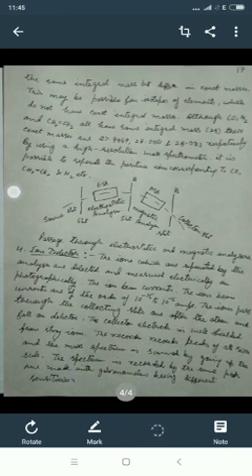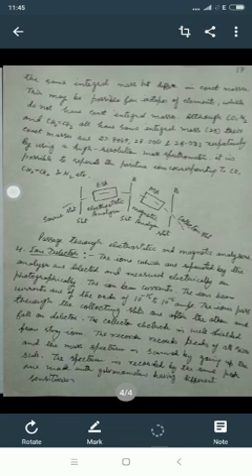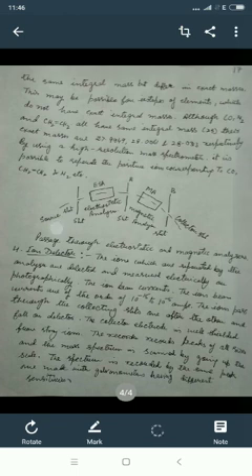The recorder records peaks of all sizes, and the mass spectrum is scanned by changing the scales, and the spectrum is recorded by the same peak using galvanometers having different sensitivities.